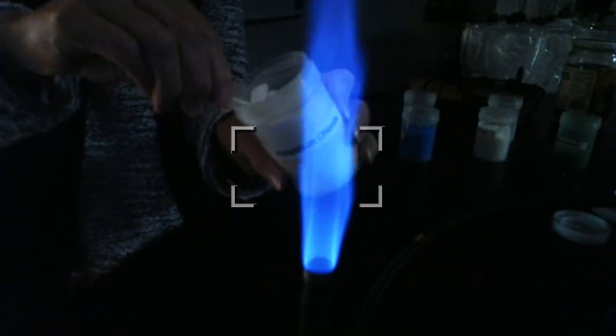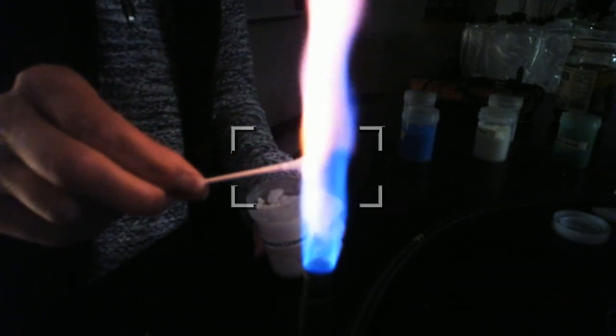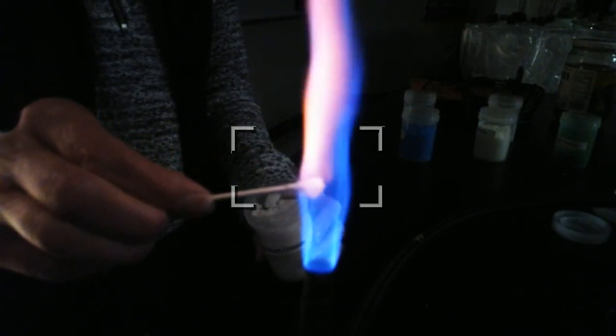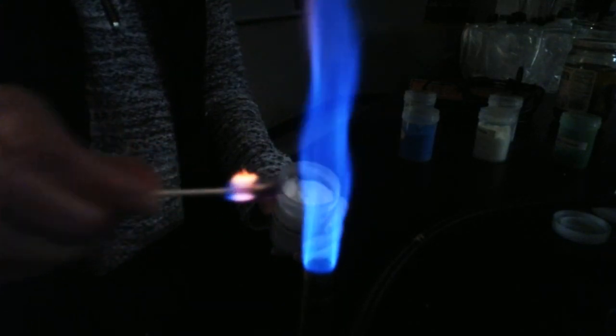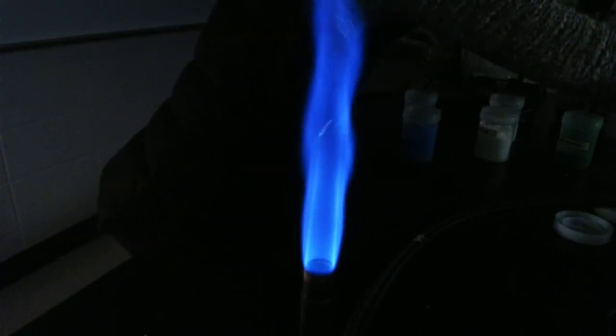So same way, I'm taking the Q-tip. This is, where is it? Potassium chloride. I have just a wet Q-tip, and I'm rubbing it in the solid, trying to get some of it to stick to the Q-tip. Sometimes you can see this one, and I'm seeing it better in person than on the video, but it's almost kind of a lavender. You'll get a light purple from the potassium, which is kind of cool. I don't know if you can see a little bit of a light purple in there. So purple or violet would maybe be a higher energy color. So the electrons are making bigger jumps and then releasing larger amounts of energy as they fall back down to the ground state.